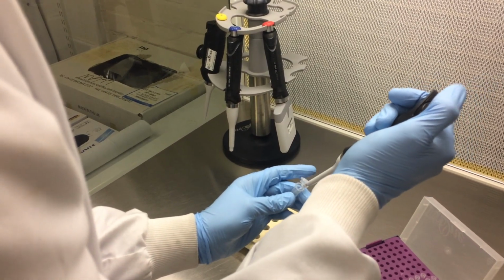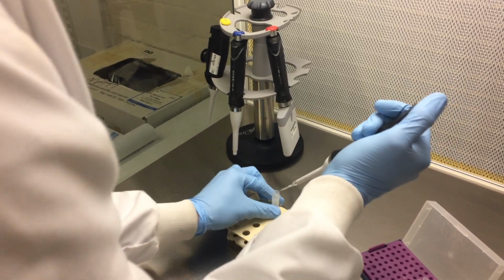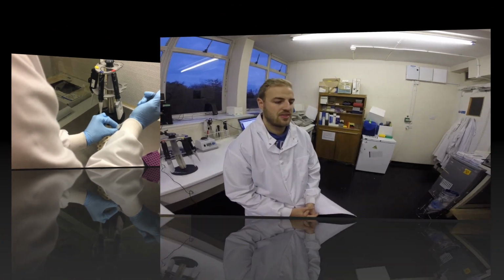Currently, we use quantitative or real-time PCR to test for BD-DNA on the skin of an amphibian. That allows us to determine whether it's infected and therefore whether it needs treatment or removal from the environment. The problem with real-time or quantitative PCR is once you've taken the swab, moved it to a specialist lab, and then run the assay, it can be days, maybe weeks before you get a result. That prevents you enacting fast responses to infections, outbreaks, or novel diseases.